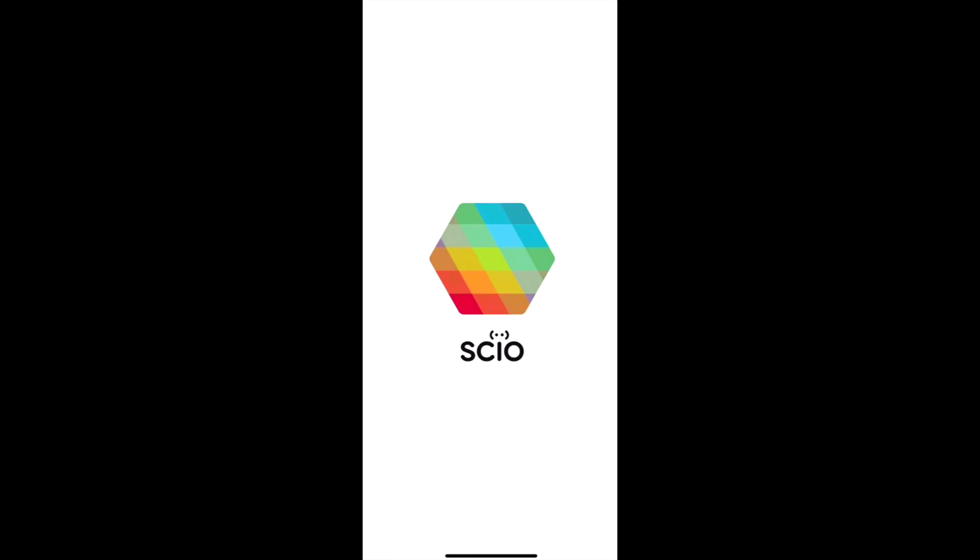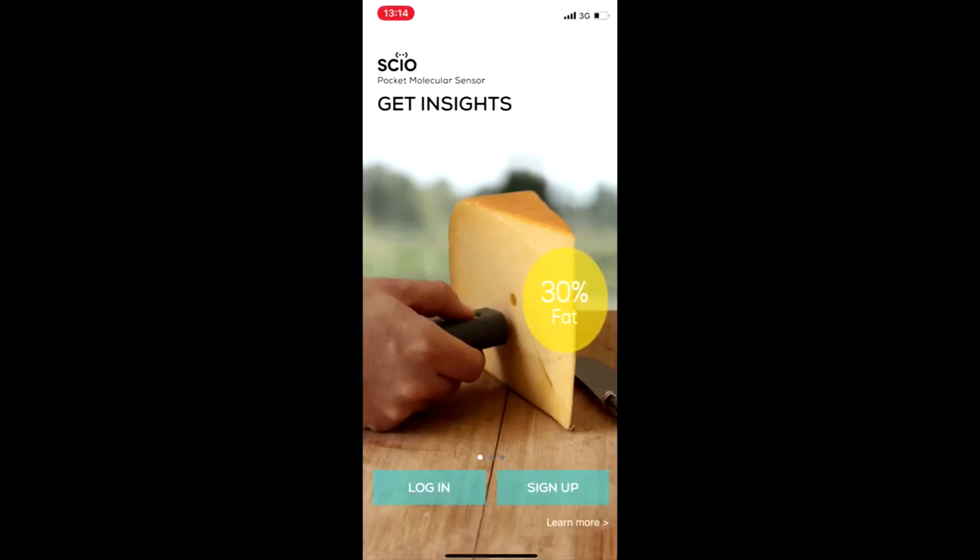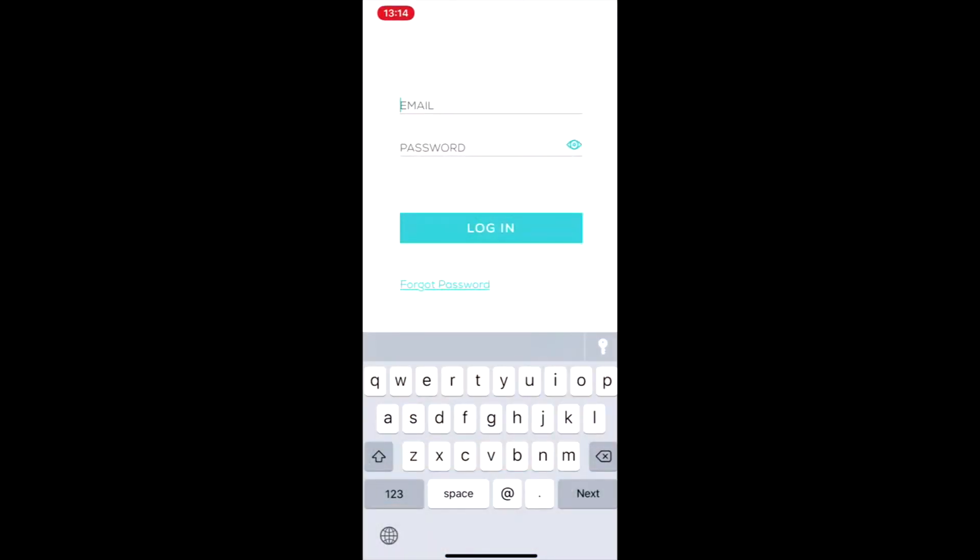Once installed on your phone, launch the app, tap the login button, and enter your email and password.